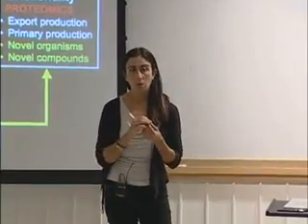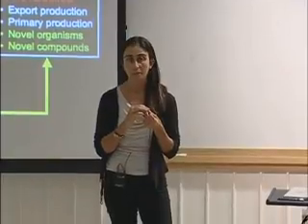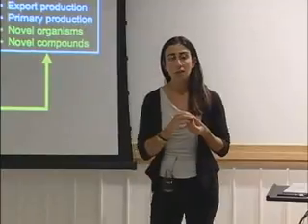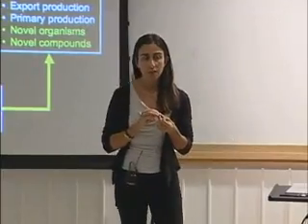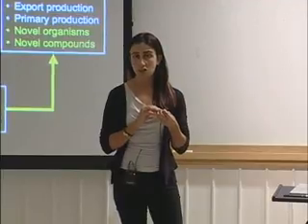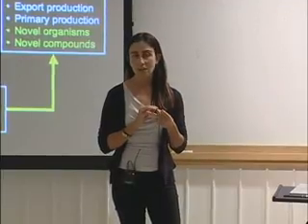So you monitor bacterial cell counts in your cultures? Yeah, and through the culture, at the end of the culture, when we harvest. Also, we can identify bacterial proteins quite easily, so we don't see that as a problem.